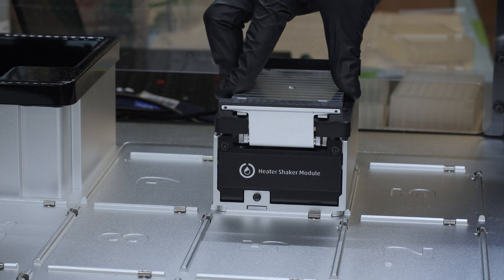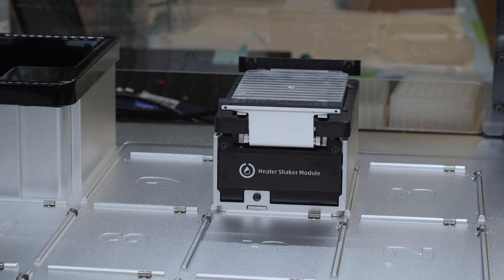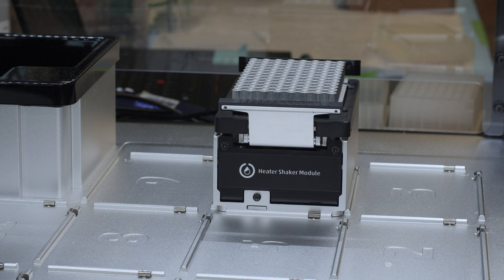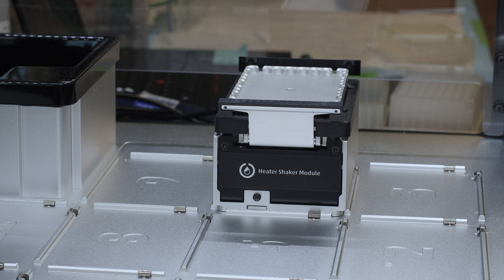Choose the adapter that's right for your labware. There's a universal flat plate adapter, a PCR plate adapter, a deep well plate adapter, and a 96 well flat bottom plate adapter.